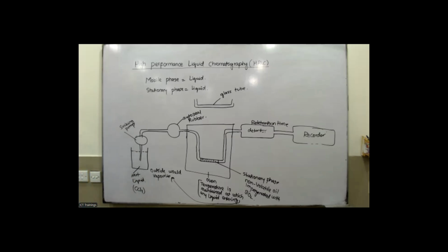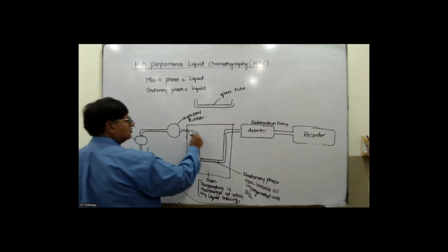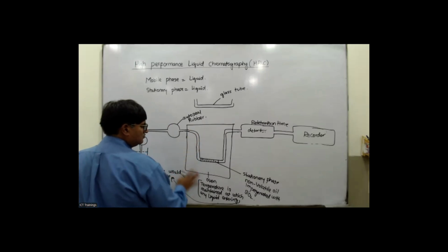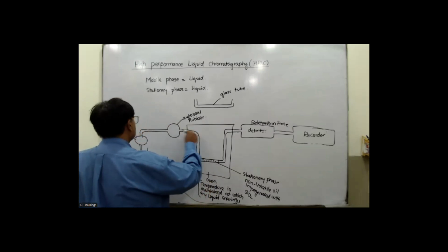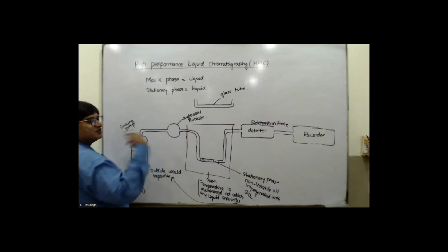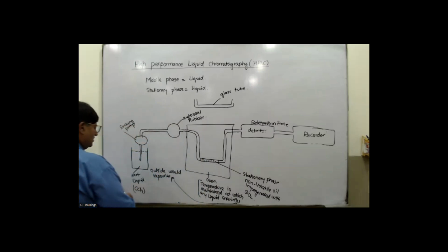Okay. So normally what we do, my dear, this is the sucking pump. This sucking pump is going to suck the inert liquid from here, that goes into the oven. As soon as it goes into the glass tube, which is present in the oven, as soon as this inert liquid enters the tube up here, it would vaporize. So these vapors consist of only one thing, CCl4.